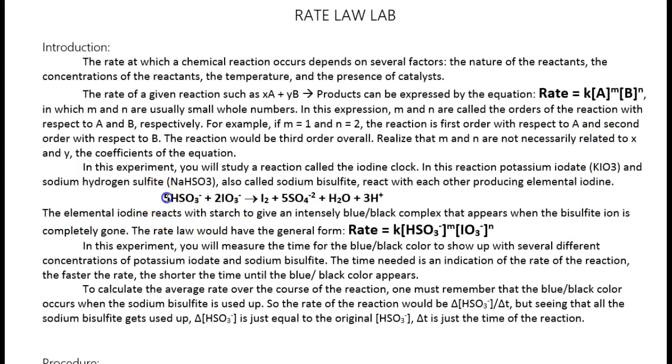So here's the reaction that we're doing. It looks a little bit strange because it's an ionic equation, so we've got some ions involved instead of everything being uncharged and just balanced charges. But that's okay. It's not really the point here. We're going to just focus on these ions. And you're going to come up with a rate law.